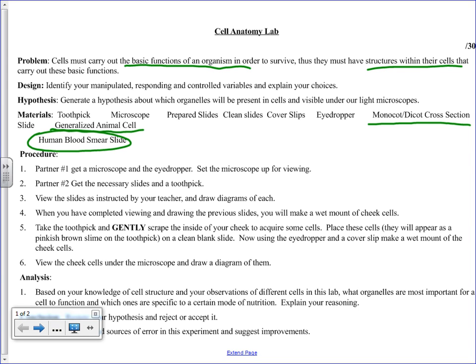When you look at them, their membrane is different, because what does a red blood cell do? What does it carry? Oxygen. So its membrane is a little bit thicker. It's laced with hemoglobin, and it catches the stain in such a way that you can't see into the cell. So you wouldn't be able to see anything inside the cell, and there's no nucleus in them because they don't have one.